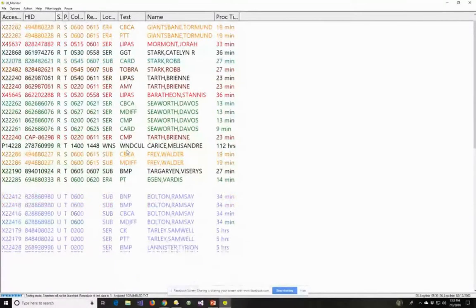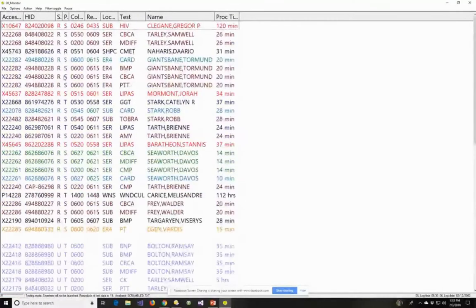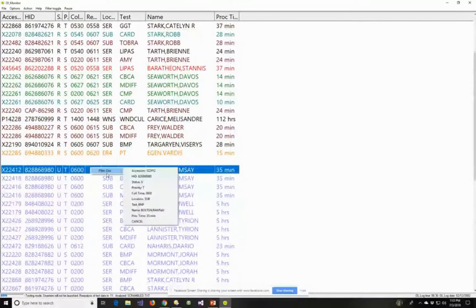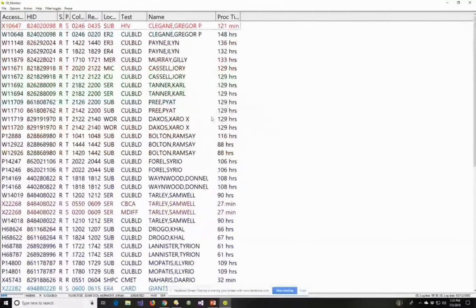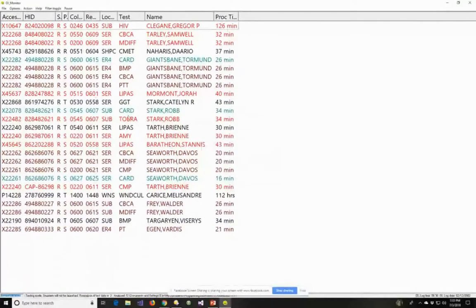The techs are saying they don't really want to see any uncollecteds. So we can just filter out all these uncollecteds — this isn't the only way you can define filters, this is just the super quick way. Now we've got a nice clean list. The sorting is going to make this look a lot better — we'll get into that in a minute.